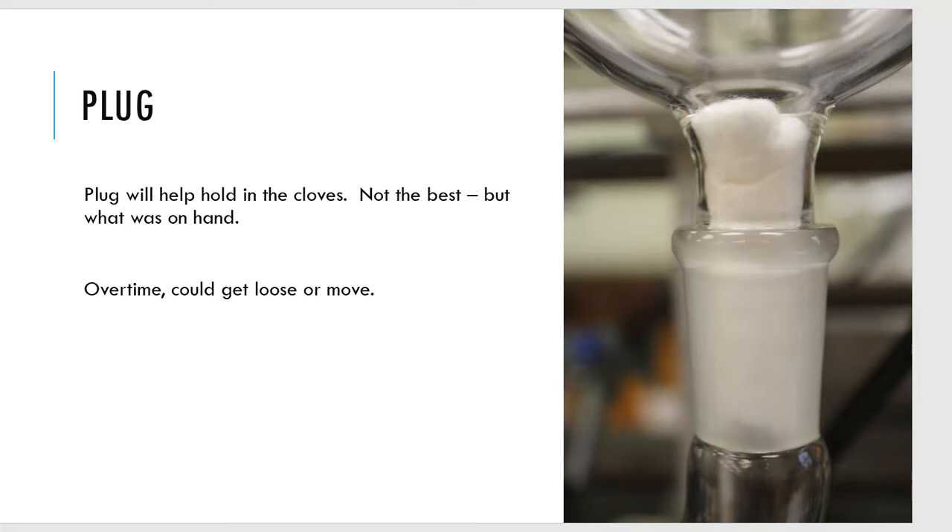Now that I've got the sidearm adapter on, that sidearm is going to go into what we call a west condenser. You've seen west condensers before. We need to hook up water to this west condenser — water in from the bottom, circulating up through the west condenser to keep it cold, and water out at the top. Water in from the bottom, water out from the top — that is the setup every single time.